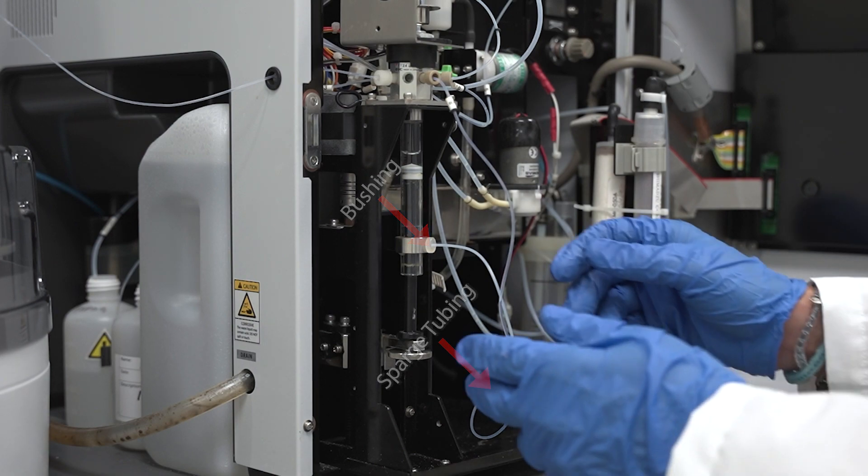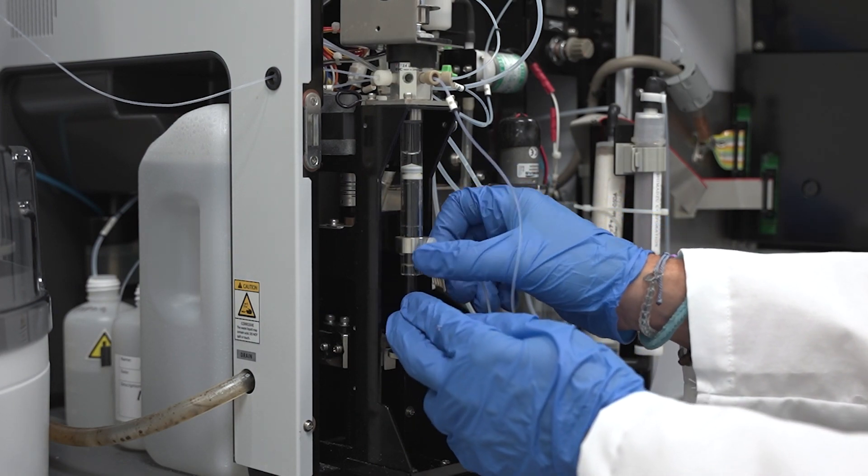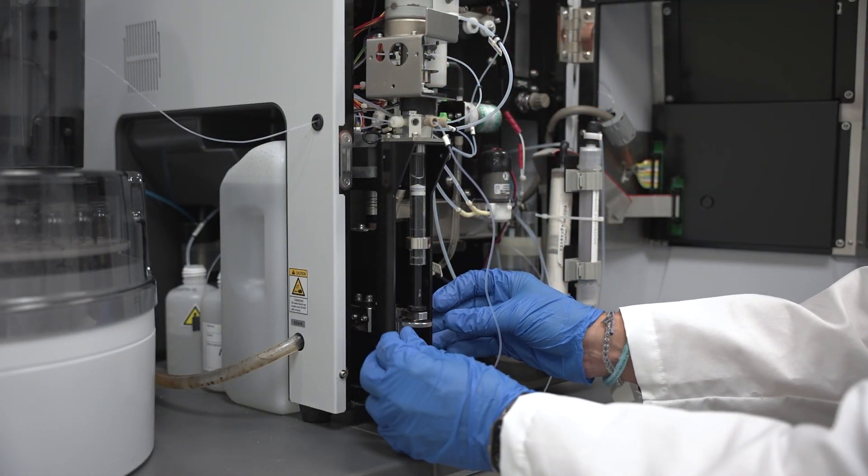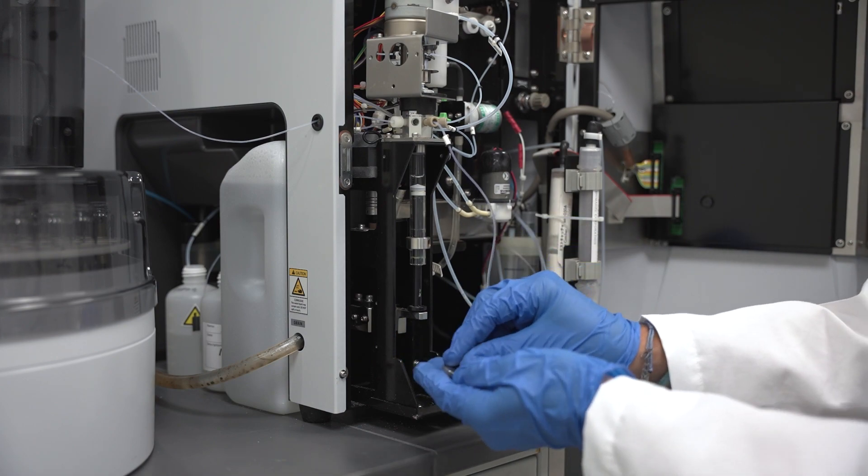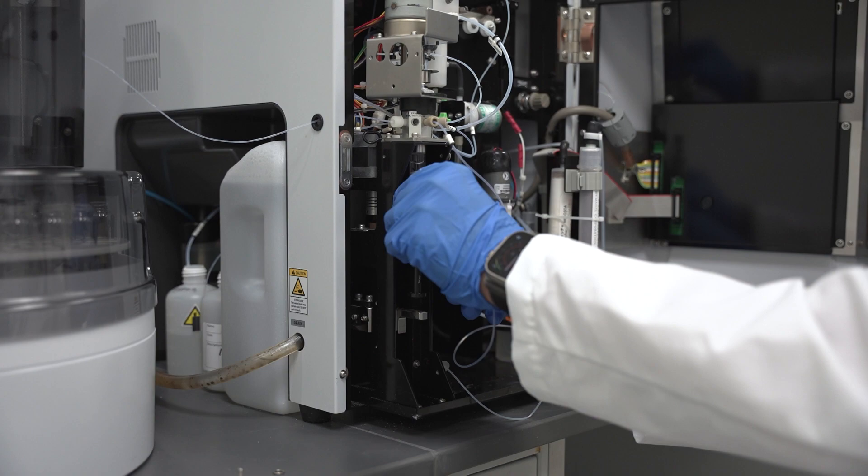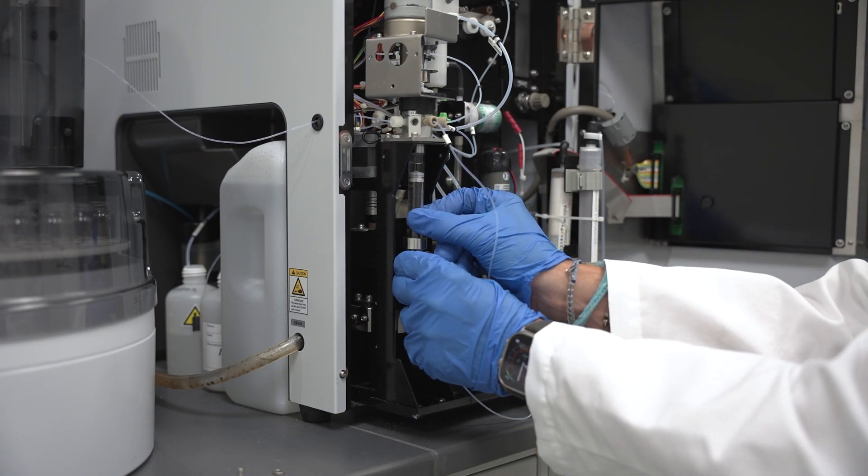Loosen the bushing on the side of the syringe and remove the sparge tubing. Remove the large retaining screw that connects the syringe plunger to the drive arm, making sure to not lose the locking washer. Firmly grasp the glass barrel of the syringe and unscrew it from the valve.